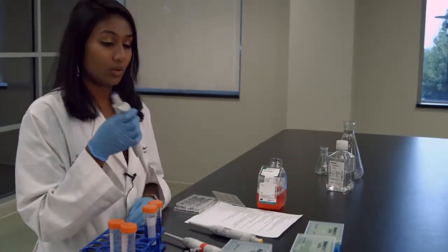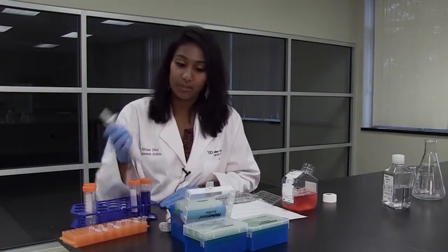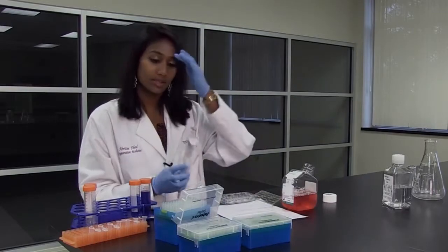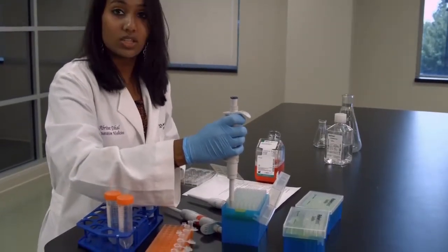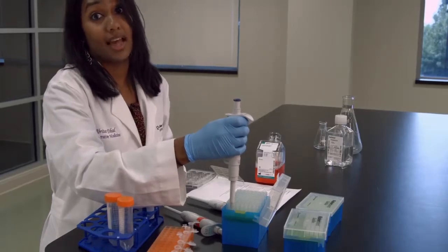When we want to take the liquid out, we put our tip on. Every micropipette has a different tip — the P1000 has the bigger ones, the P10 has the littlest ones, and the P200 has the middle-sized ones. To put the tip on, you go to the top of one of the pipette boxes, press it into the circle, and do it once more to make sure the tip is actually on.